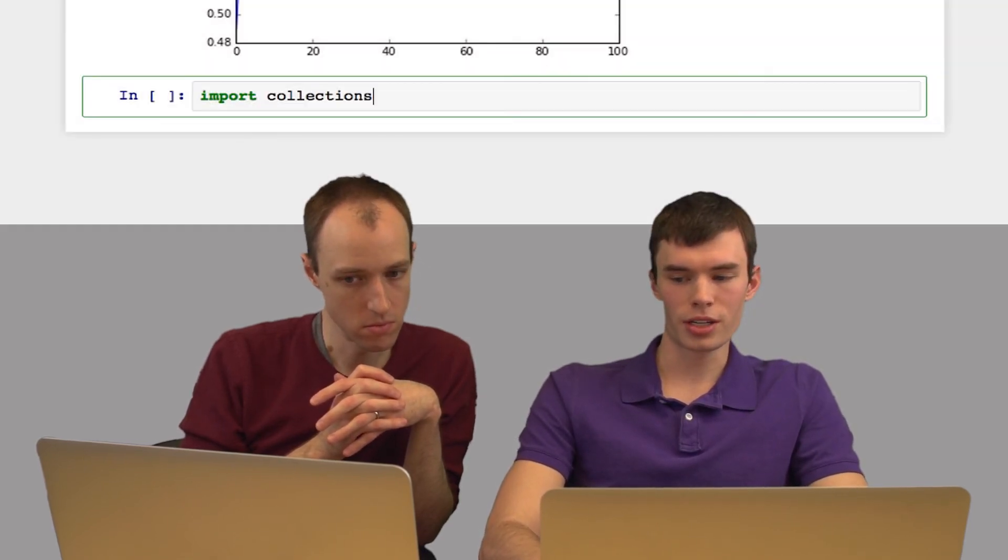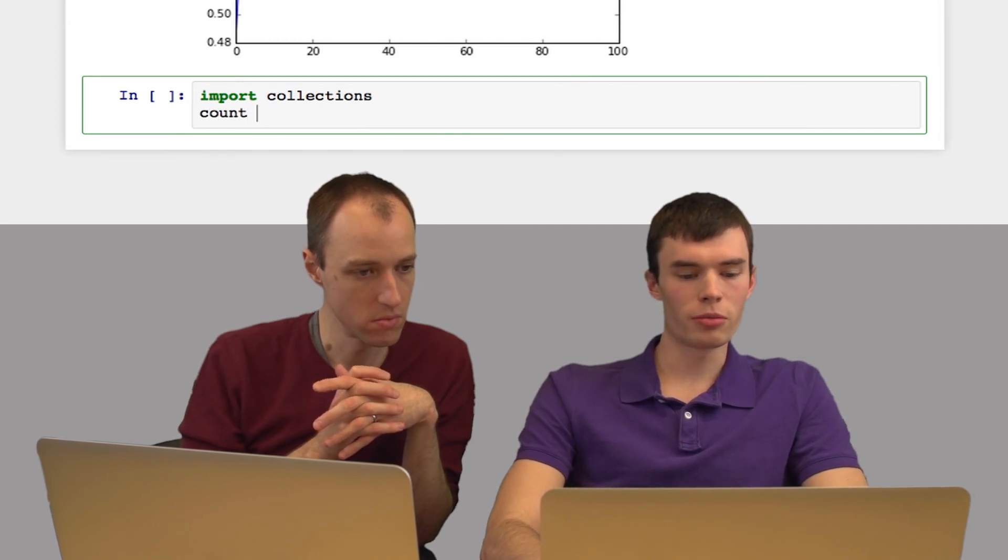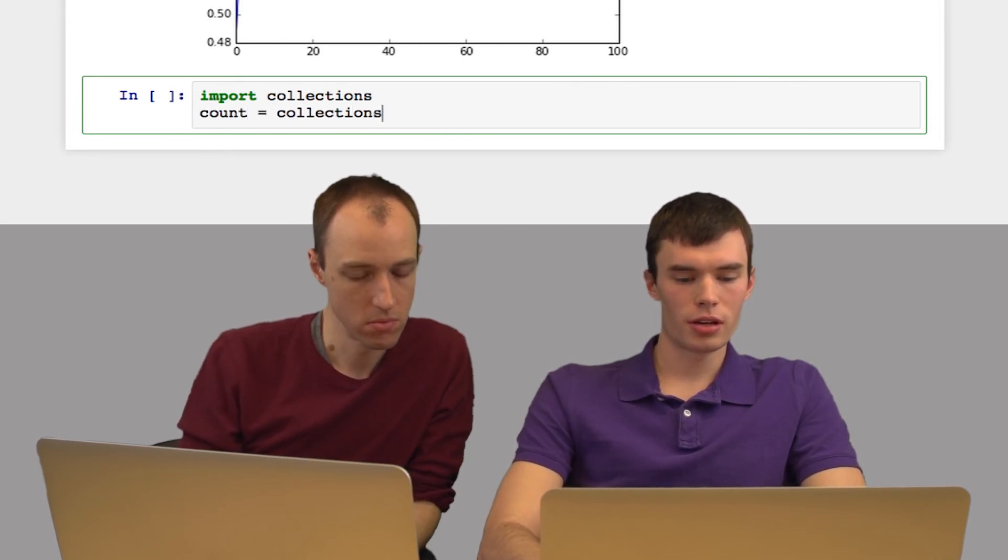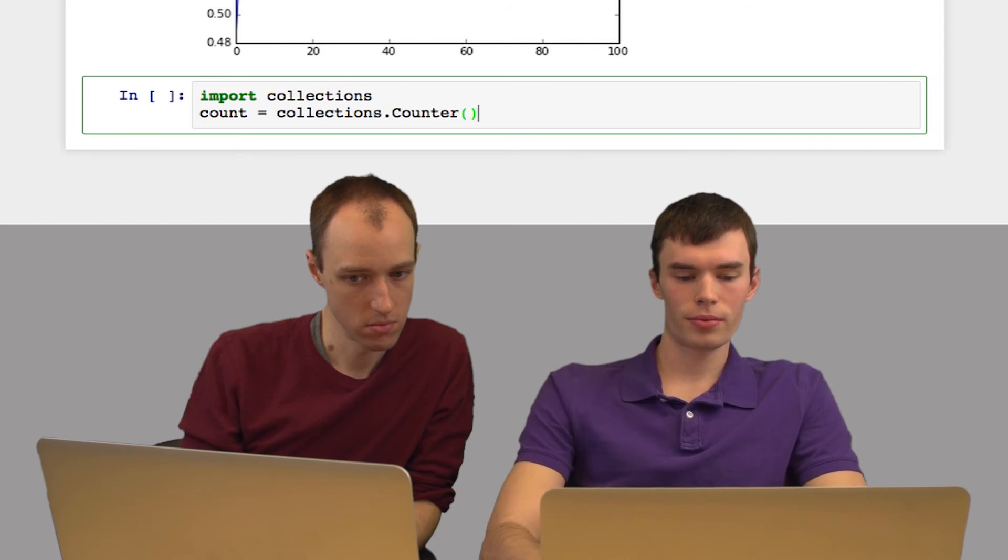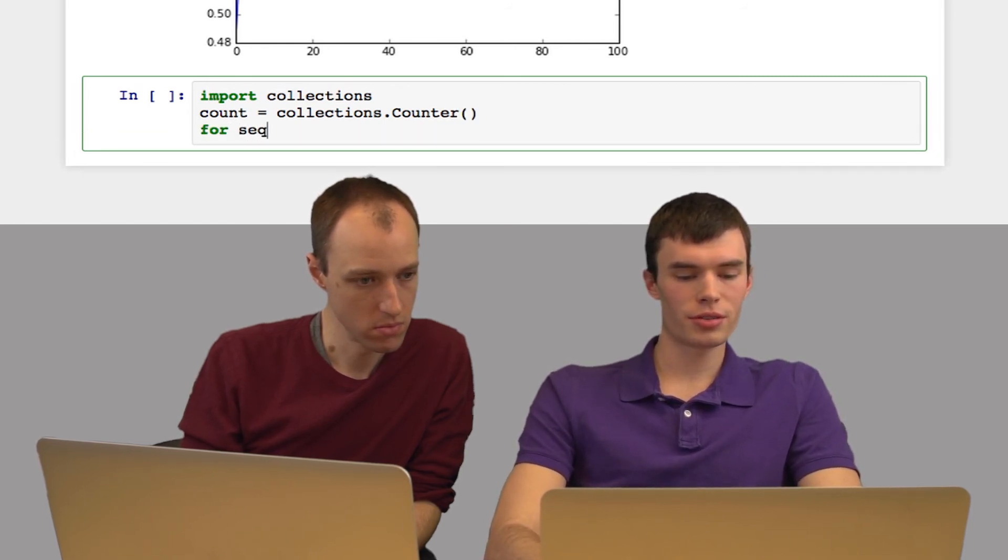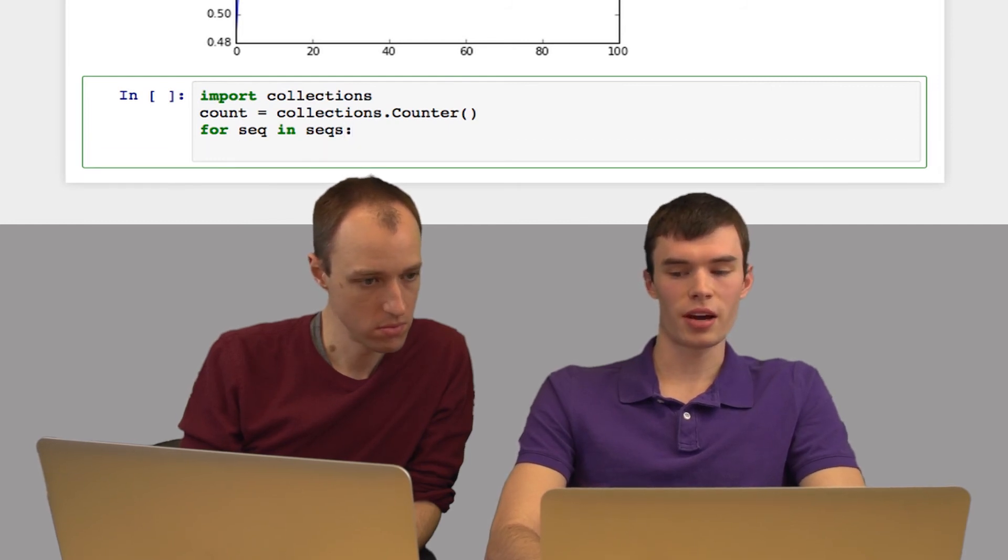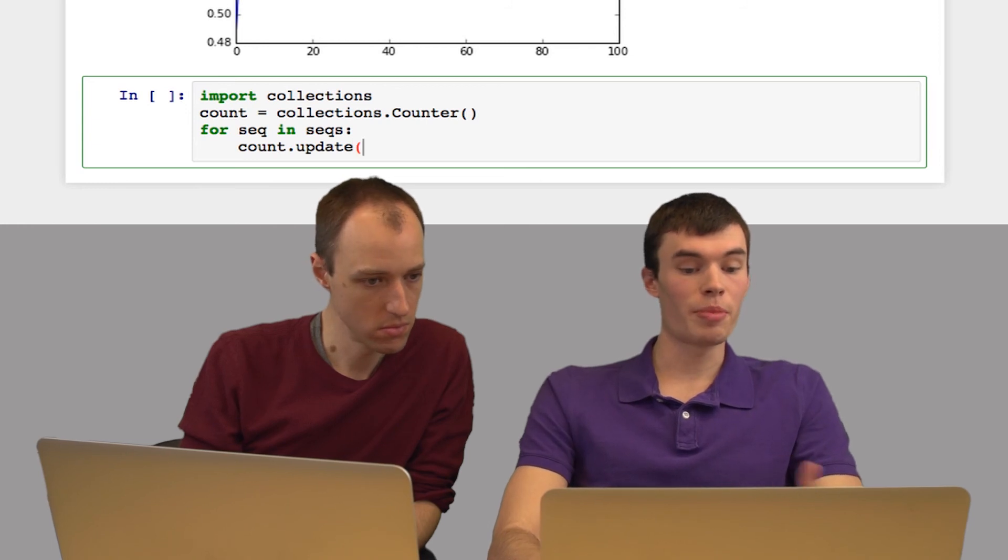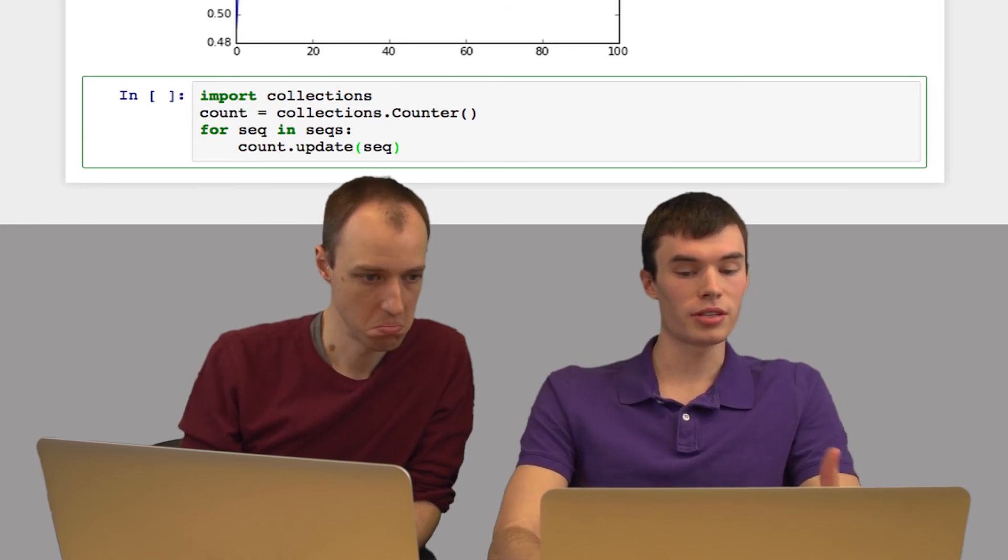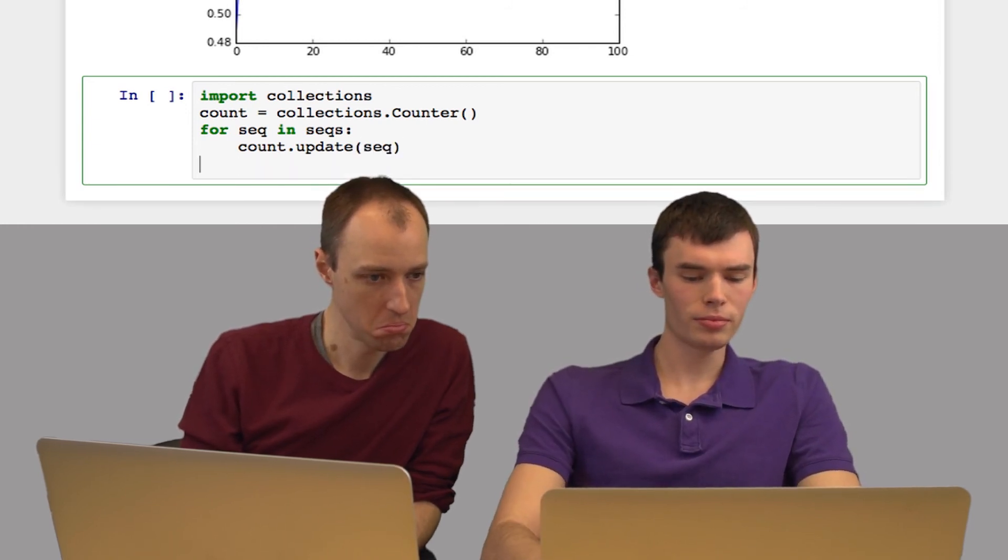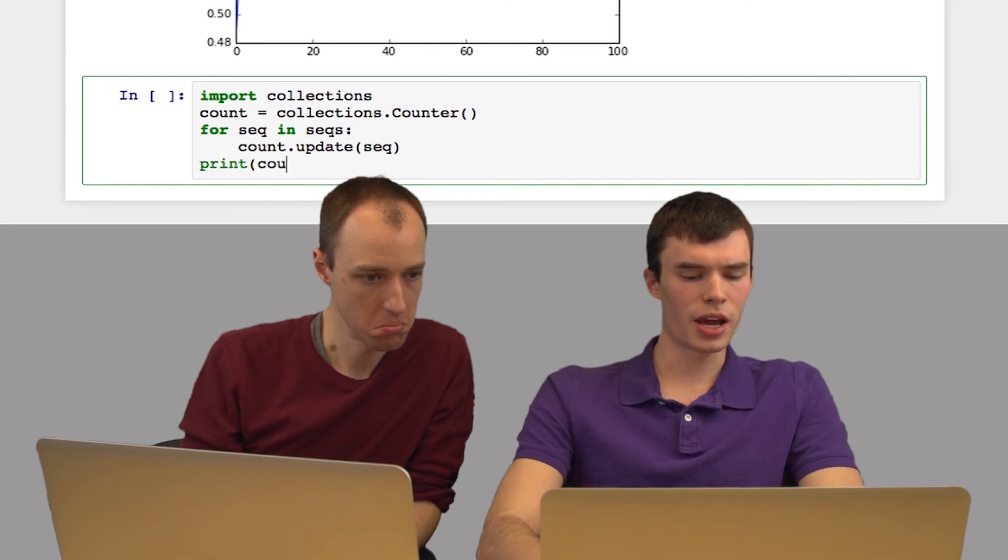I'll create a variable count, which is collections.Counter. For each sequence in our list of sequences, I'll update this counter with count.update, passing in the sequence of bases as a string. Then we'll print count when done.